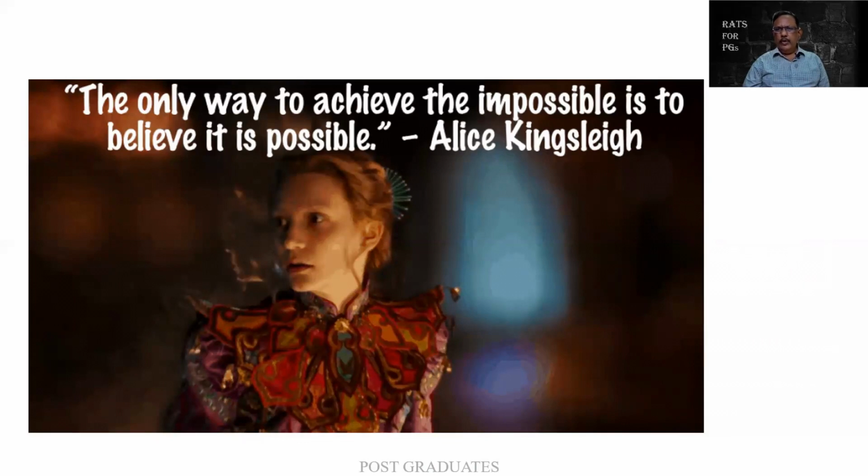The questions for you will be scanning electron microscope, transmission electron microscope, application of electron microscopy in renal pathology, in dermatopathology. Also, the advantages and the pitfalls of electron microscopy. What are all the fixatives that could be used?